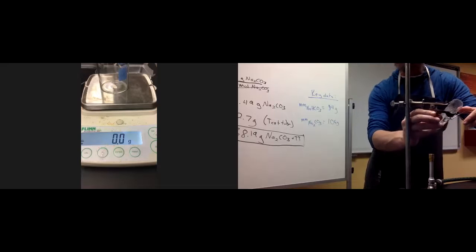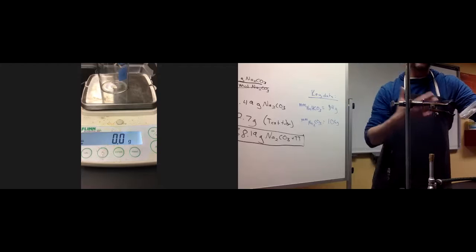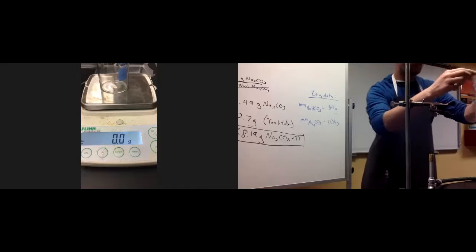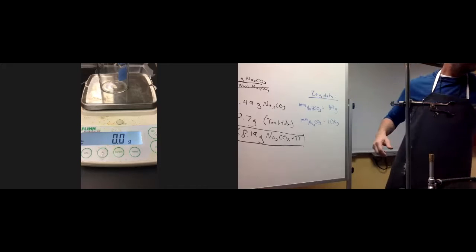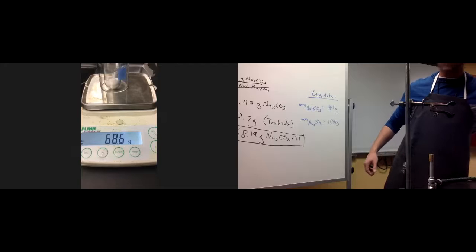And again, I'm expecting the reading to be 68.19 grams when I put it on the balance. If it's not that, that means my reaction has not gone to completion and I probably need to continue heating. So 68.6.